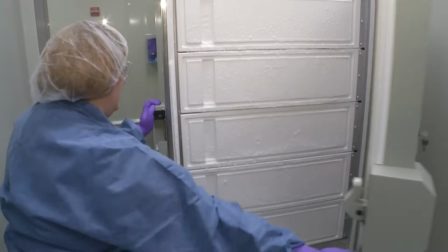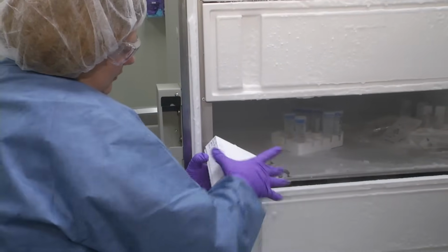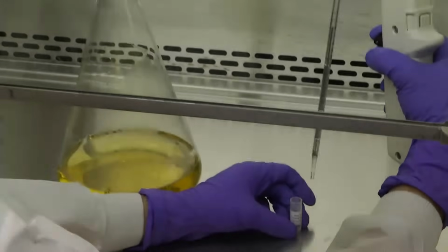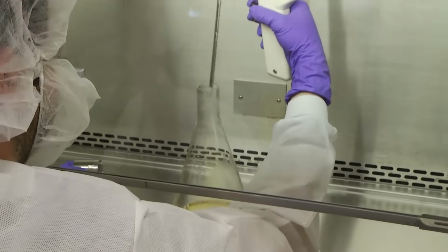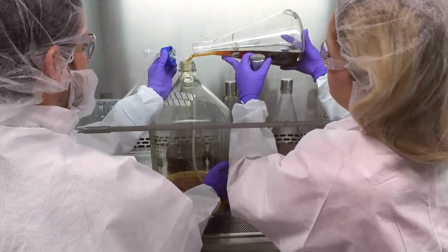The GFP fermentation process really begins with the expansion of our bacteria seed stock. After removing the specially modified E. coli from the freezer and thawing it, it's used to inoculate a small amount of fresh media in a shaker flask. After the number of cells has reached the target amount, the thriving cells are ready for fermentation.